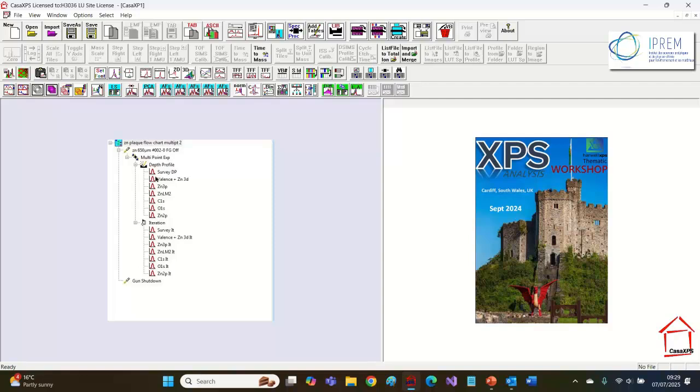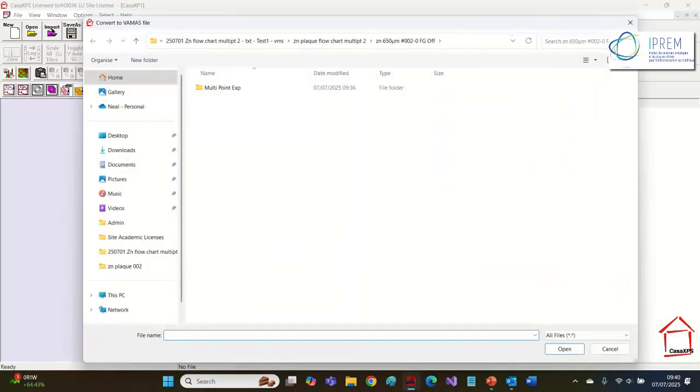The result, when we convert the Avantage data files from the binary format into the AVG format, are a set of files that are organized in quite an intricate way, which does require the .dth filter to convert. To convert data that have been saved by Avantage after it's been converted to the .avg format, we use the import option, which says convert file, and what this will do is it places us in a directory which is part of the directory structure that has been generated by Avantage that contain the various Avantage files.